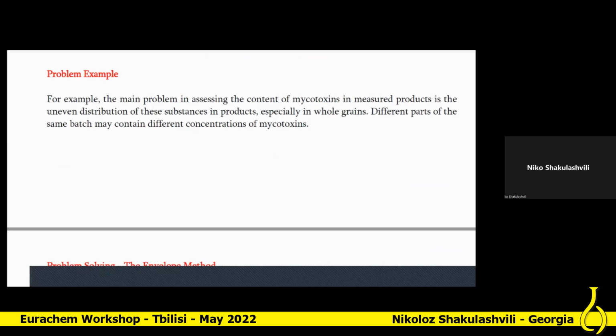We need to assess the content of mycotoxins, and it all depends on how these products are stored and what the size of these objects is that need to be analyzed. The problem is that the particles are not distributed evenly in the entire sample. So if we take the sample only from one location, we may have inaccurate results.